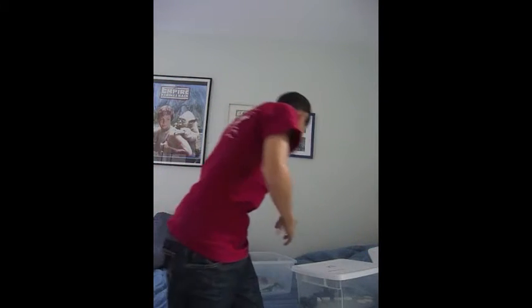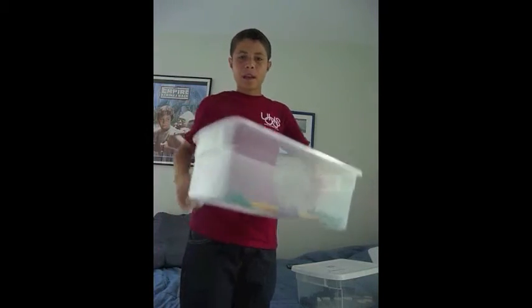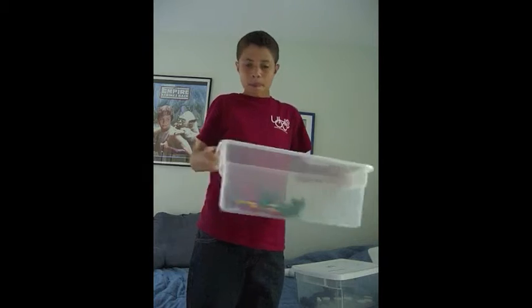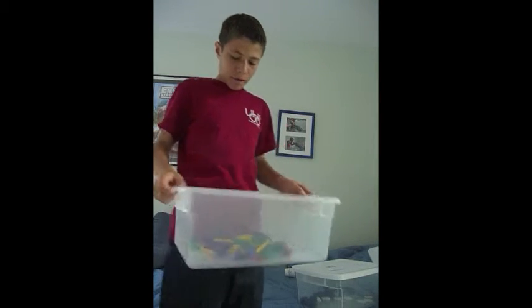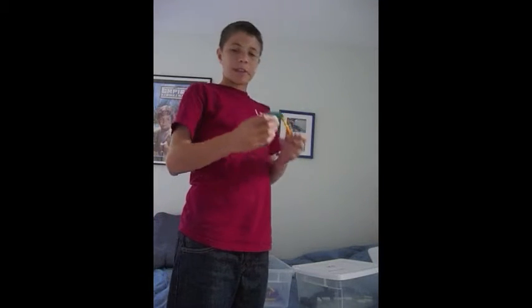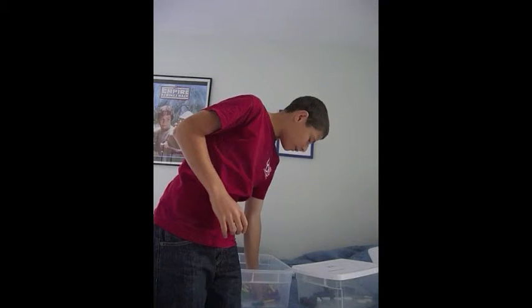Now let's see what happens when you mix water, H2O, with lead nitrate. So here's my lead nitrate, here's my H2O. Gonna pour it in, mix it up. Now let's take a look. So now we got a bunch of nitrate ions, which has a negative charge. And you have a bunch of lead ions with a positive charge.